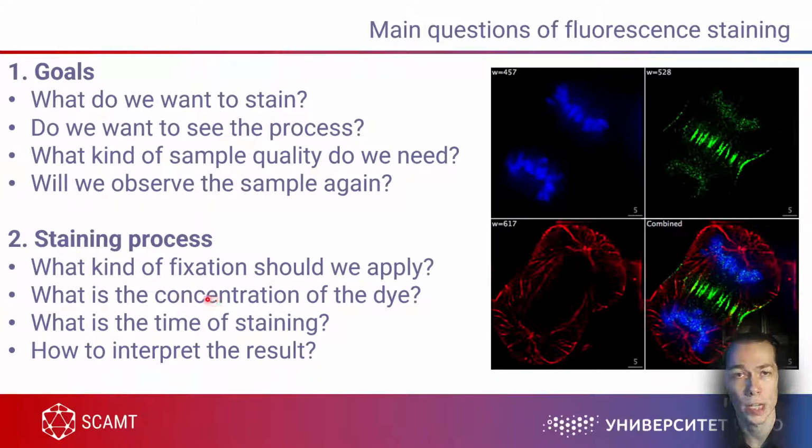And there are a lot of technical questions. What is the concentration of the dye? This is a question which should be answered by cell biologists, not by chemists with nanoparticles, but still it's a lot of different technical questions. What is the concentration of the dye, what is the time of staining, and, one of the most important again, how to interpret the result, because sometimes results can be quite complex.